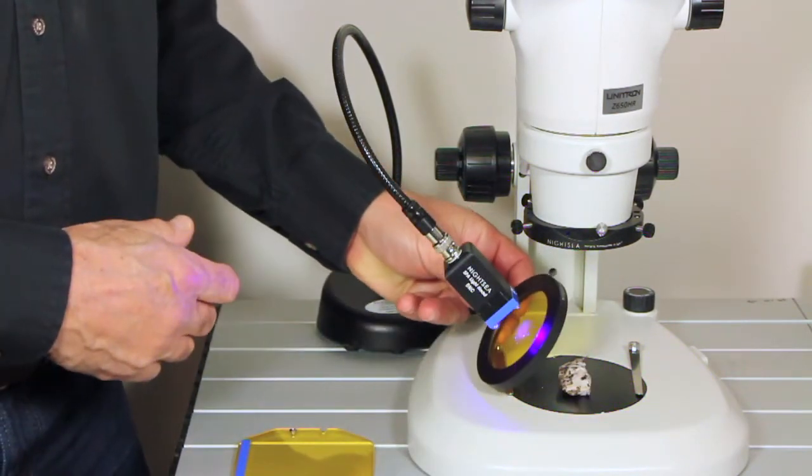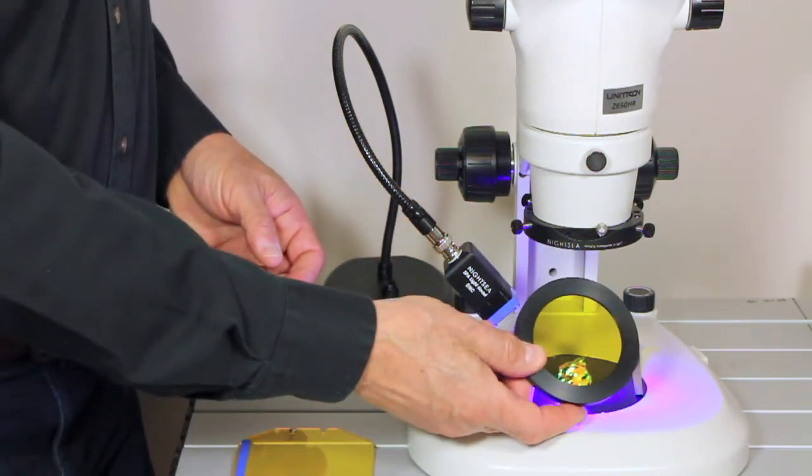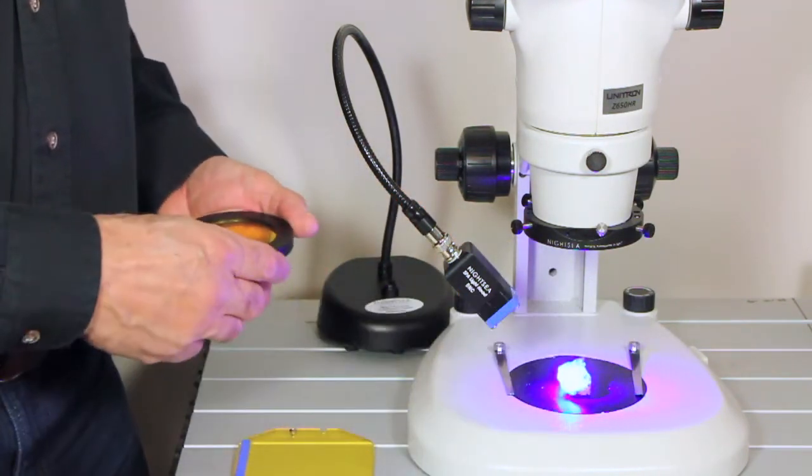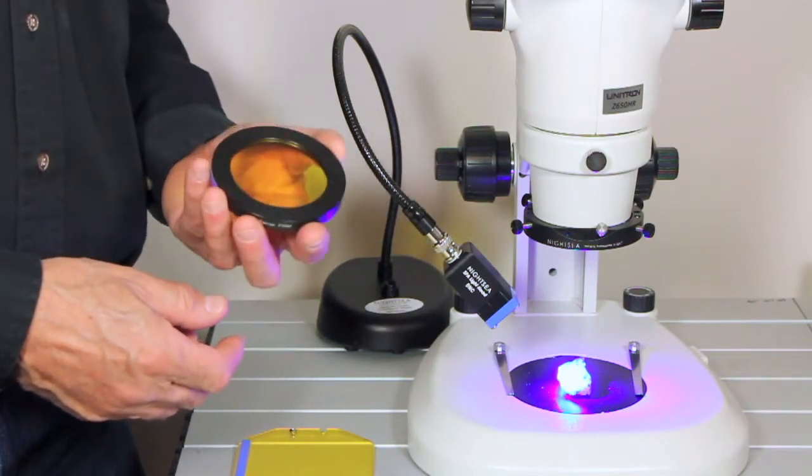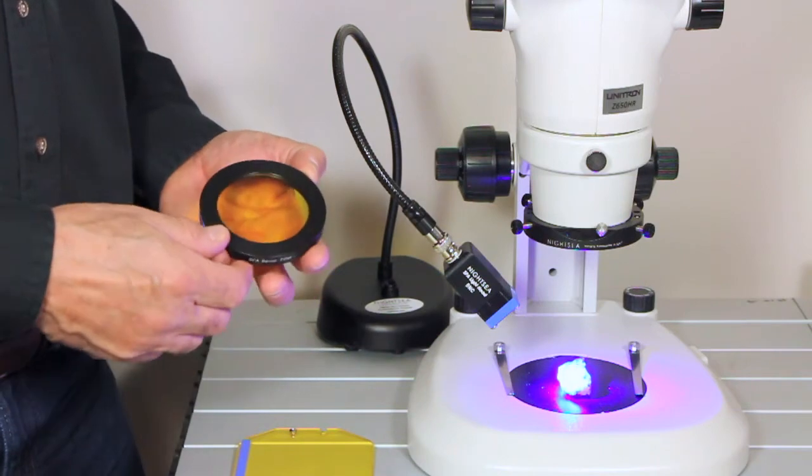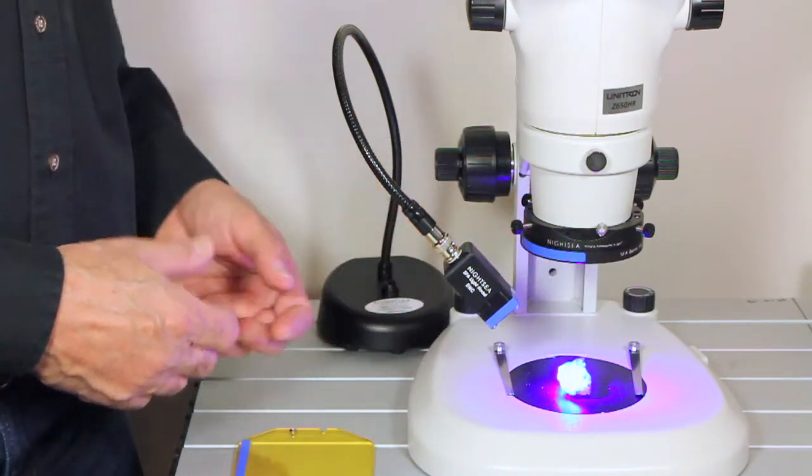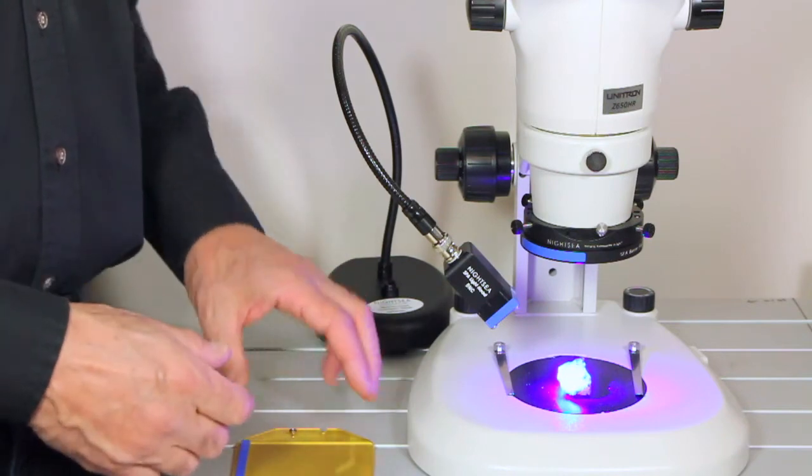Its job is to block all the excitation light and transmit the fluorescence. And the purpose of the adapter ring is to hold this in the optical path so that when you're looking through the microscope with your eyes or a camera, you'll see the fluorescence. And that just attaches magnetically to that adapter ring. Easy to put on.